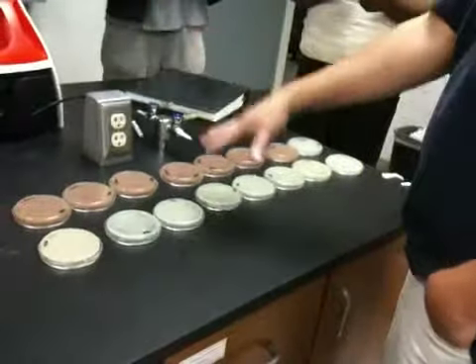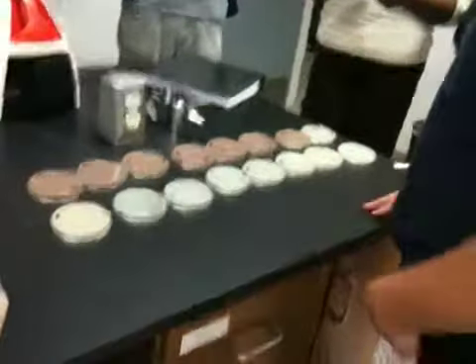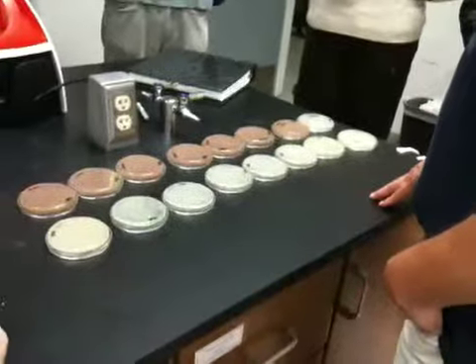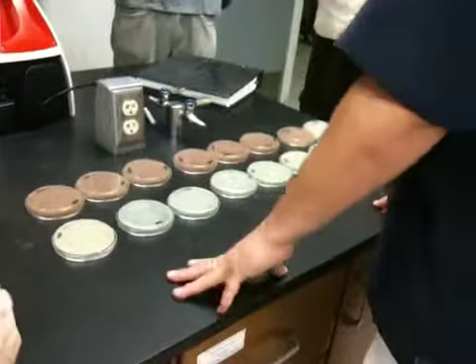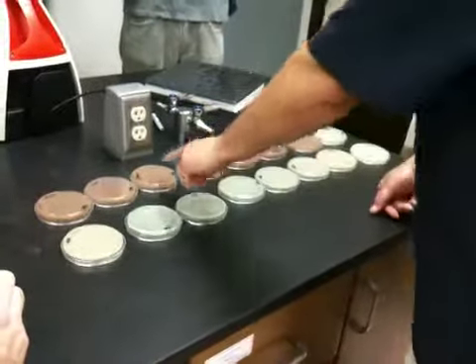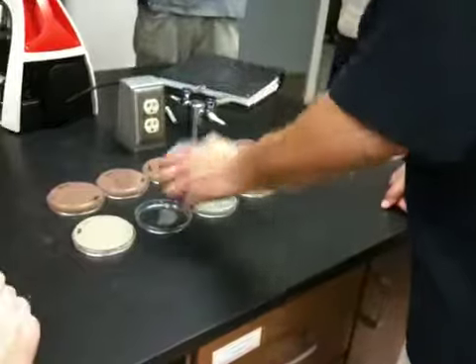Okay. And it was effective at what point? 1 minute. Less than a minute. Up to 3 minutes. No, less than a minute. What organism were they inoculating? Serratia marcescens. Which is this one. It's a gram-negative organism. Okay.